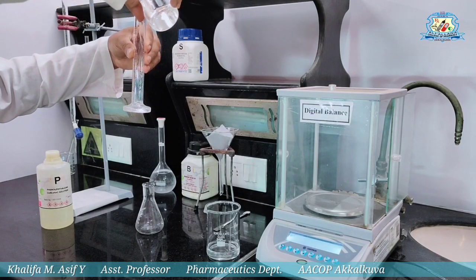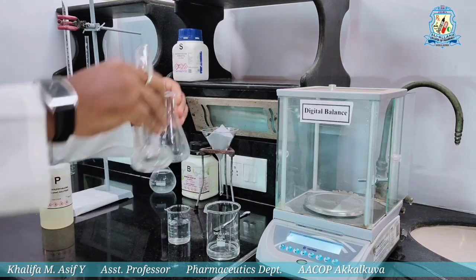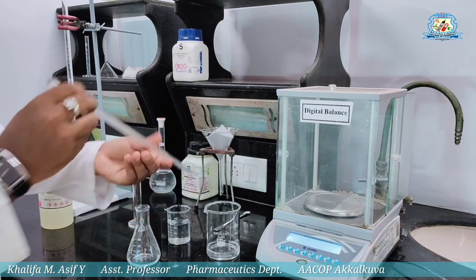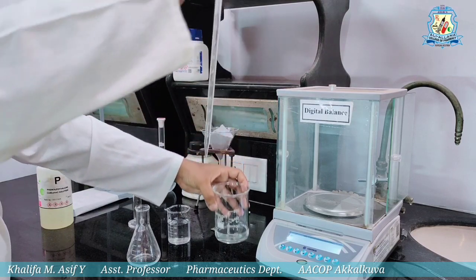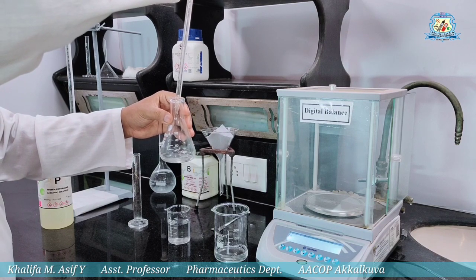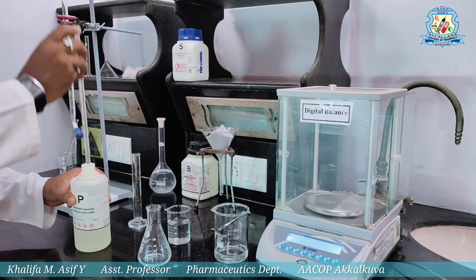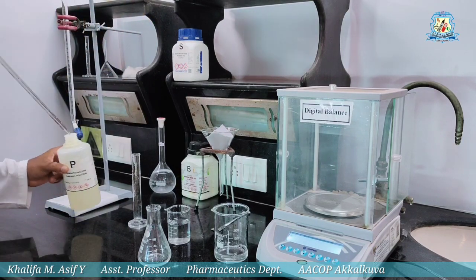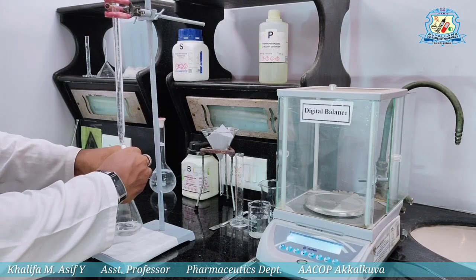So the next step is to analyze the saturated solution by titration. For that, 10 ml of distilled water has to be taken out and transferred in a conical flask, and 1 ml of saturated solution of benzoic acid has to be added to the conical flask with the help of a pipette. Before going to the titration, 2 to 3 drops of phenolphthalein indicator have to be added to the conical flask. Now our mixture is ready for the titration.